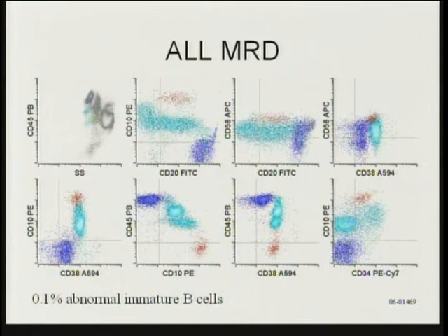And what one can see is that although the immunophenotype of this abnormal population is similar to that one might see normally, in that it expresses things like CD10, the level of CD10 is expressed at an aberrantly high level in comparison to normal B-cell maturation here below it, where both CD10 and CD20 are being acquired in a normal pattern of maturation. In addition, the level of CD58 is slightly overexpressed in comparison to normal. The level of CD45 is aberrantly underexpressed and in fact is entirely absent on this population in comparison to even the most normal immature population.